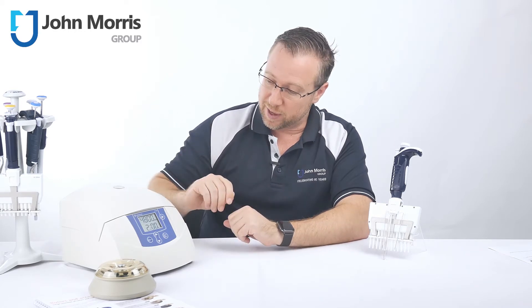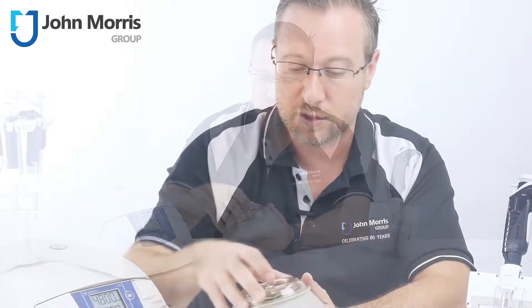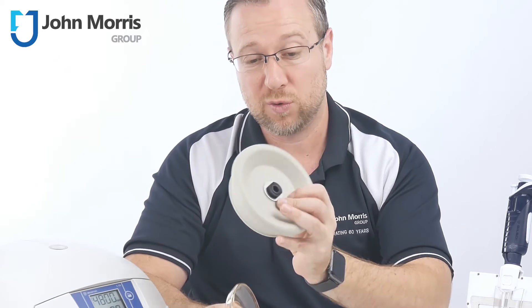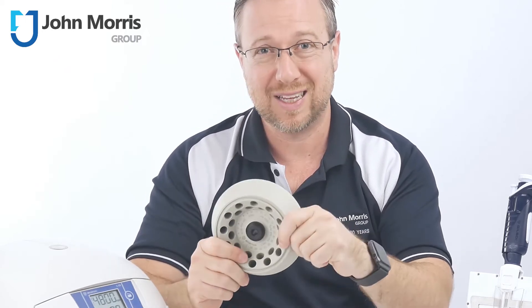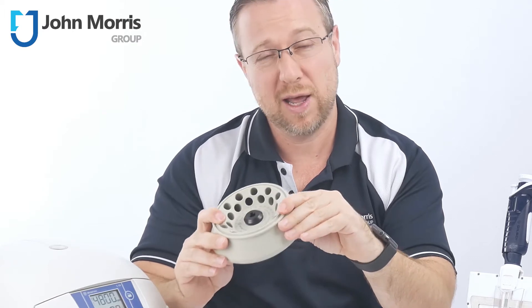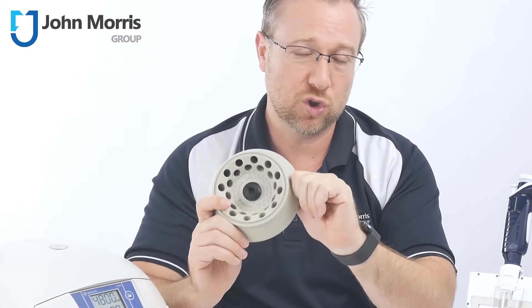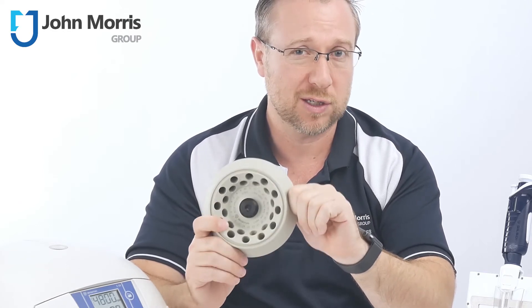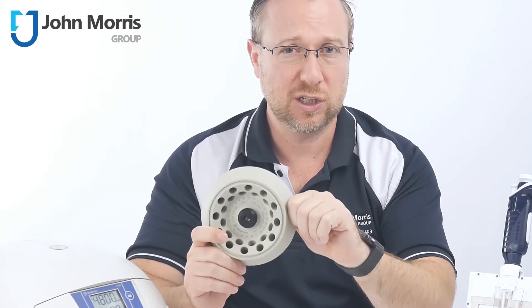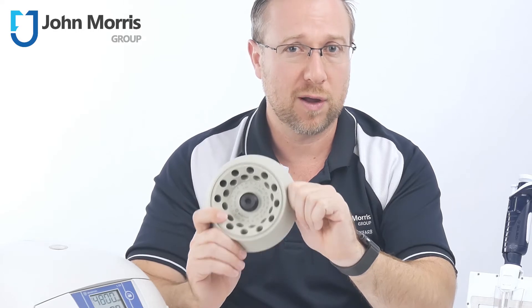Some nice little features about it. Firstly, rugged and reliable — we've already covered that. There are 10 different kinds of rotors available. This is a plastic rotor. Plastic rotors are good because they're non-elastic and rigid. Aluminium or metal rotors can expand and contract when running, making them prone to metal fatigue. But like all rotors, you should always inspect it before a run just to make sure you haven't sustained any damage. There's a high amount of kinetic energy inside a centrifuge when it's spinning, and you definitely don't want a rotor coming apart on you.